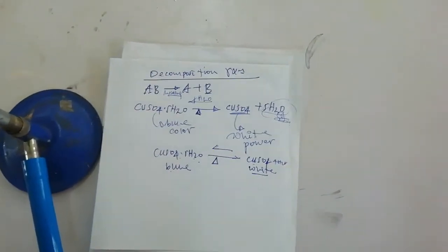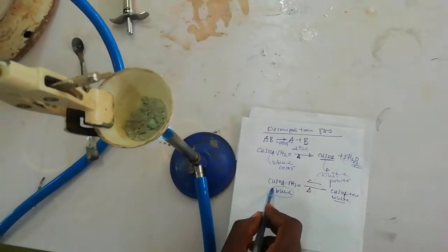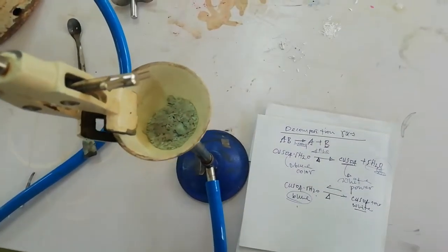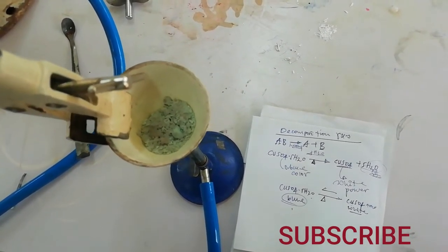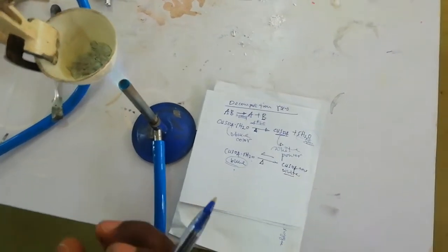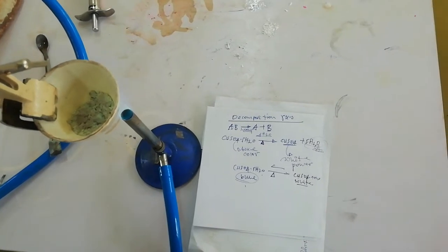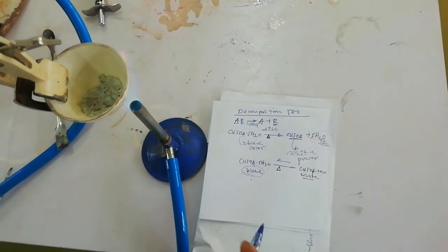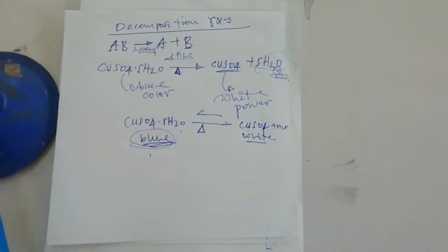If you add some amount of water into copper sulfate, we get copper sulfate pentahydrate, the blue one. Let us check whether this decomposition reaction of copper sulfate pentahydrate is a reversible reaction. Let us add some amount of water into this white powder to get back the blue crystal, which is copper sulfate pentahydrate.